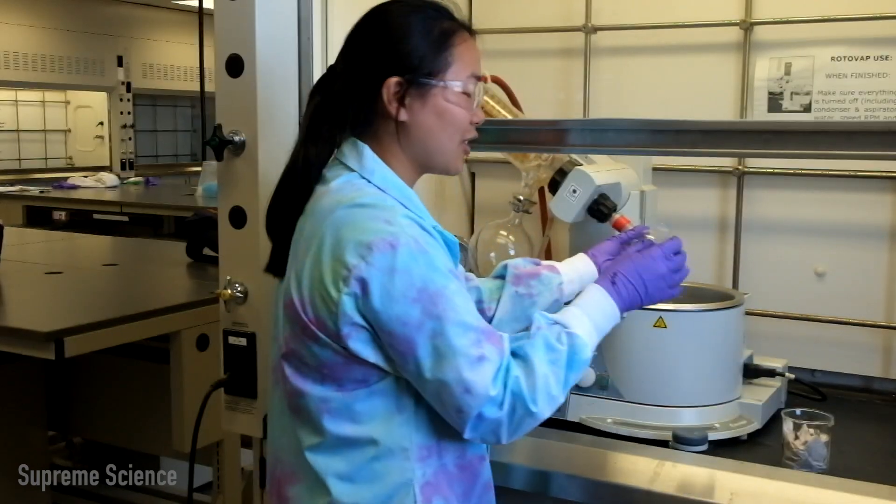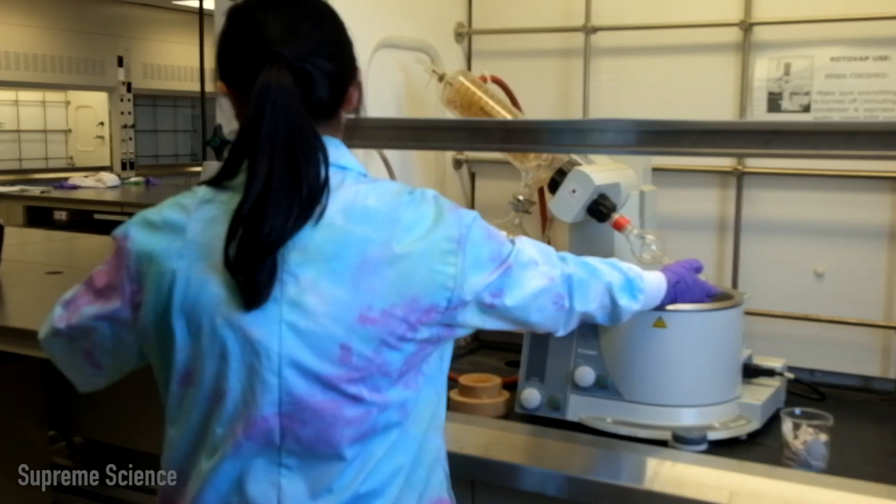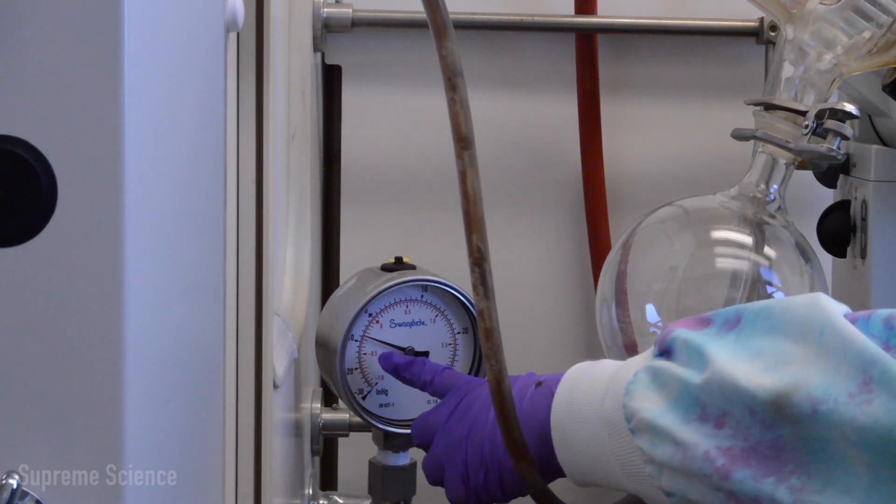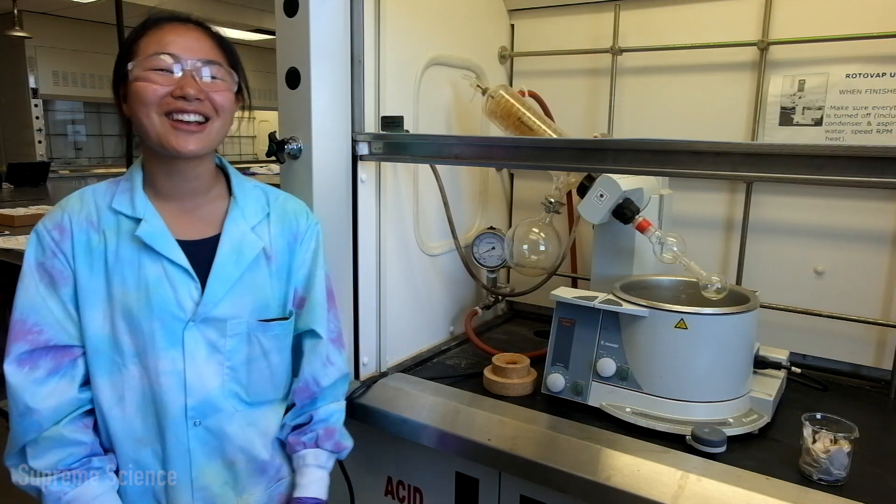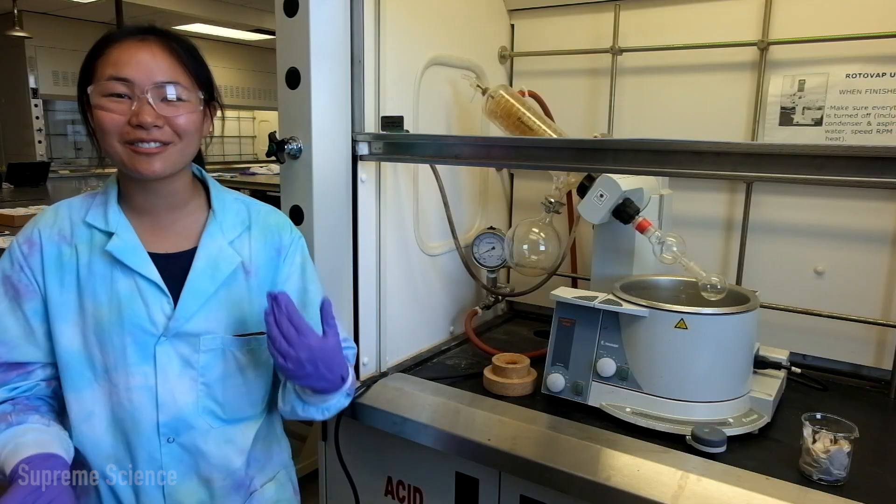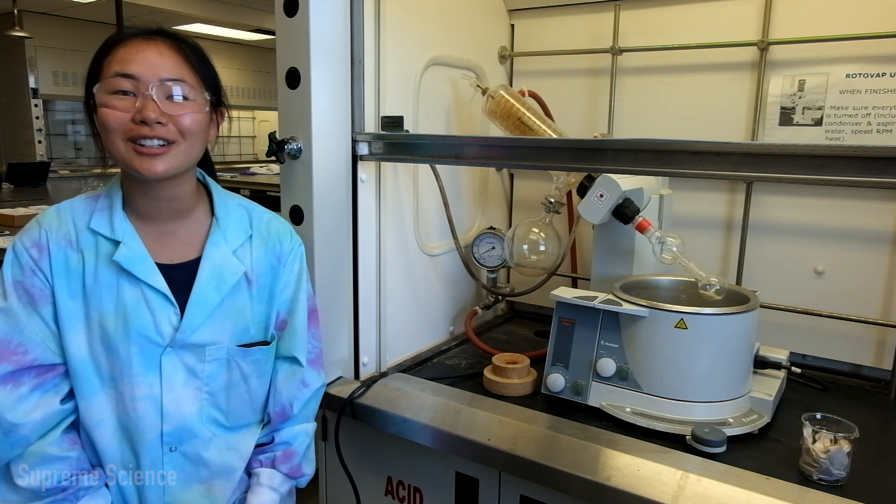And then you take your round bottom flask with your solution. And then you turn your vacuum on. Once it gets to minus 10, you can turn your rotation on. If you wait too long to start your rotation, you run the risk of your solution bumping into your splash trap and losing some of your product.